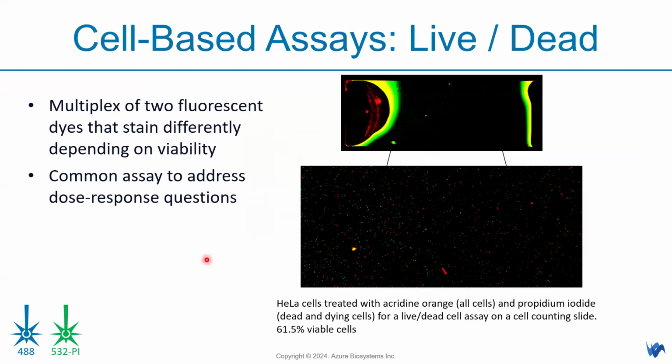Right, so let's move on to the one that will be more relevant to today's topic, which is cell-based or plate-based assays. I think this is on a 6-well plate. Oh, sorry, it's a cell counting slide. This one is a cell-based assay, looking at PI and also total cell counting. How they analyze this is they count the total fluorescence signals, comparing between two channels. That's how they come up with a value like percentage of viability and so on.